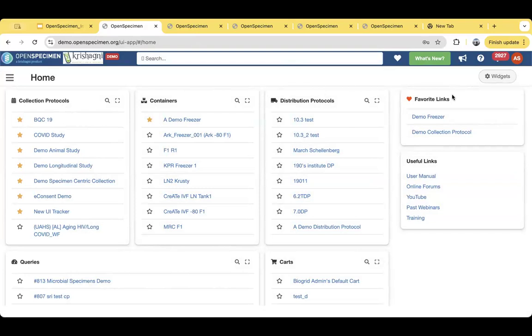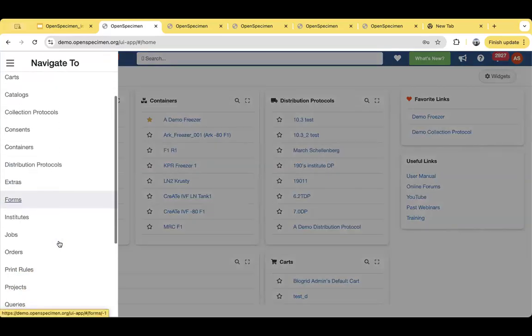It can be installed either within your institute or on our cloud, but you as an end user would have to just access the URL, which is provided by your administrator. The user accounts can also be integrated with your institute's login, so that you don't have to remember multiple username passwords. So let me go through one thing at a time.